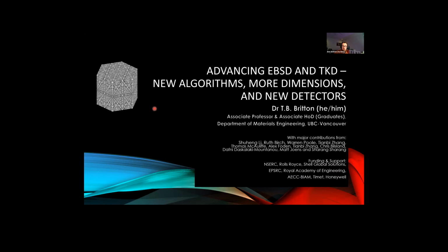There we go. Right. Yeah, so I'm going to talk a little bit about advancing EBSD and transmission Kikuchi diffraction. And I had the ambitious title of new algorithms, more dimensions, and new detectors. So we'll see where we get to.